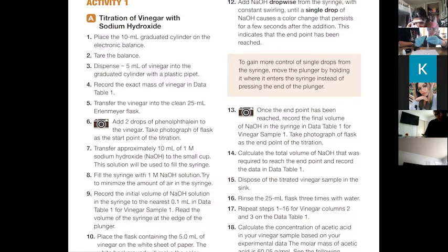So we'll just keep adding 1/2 ml at a time. And then once it gets really close, we'll add a drop at a time, okay? Swirl it. There it goes. Cool, right? Don't be in a hurry to get to the end point, because if you're in a hurry, you're going to go past it, and then you just have to repeat it again anyway. Give it a swirl. I think we went a little too far. That's all right. We're going to do it again anyway.